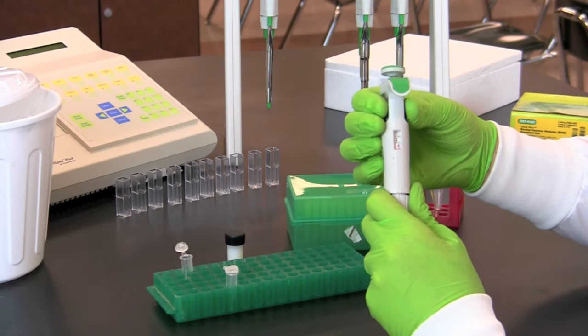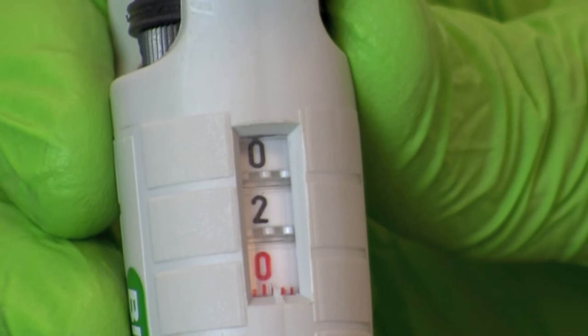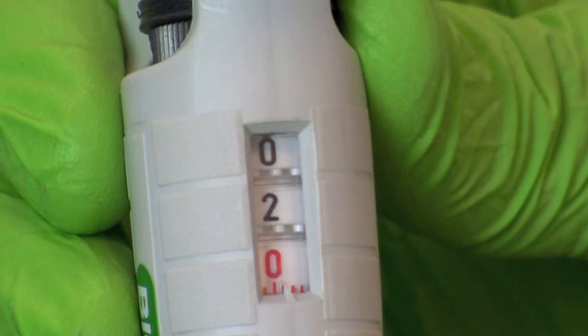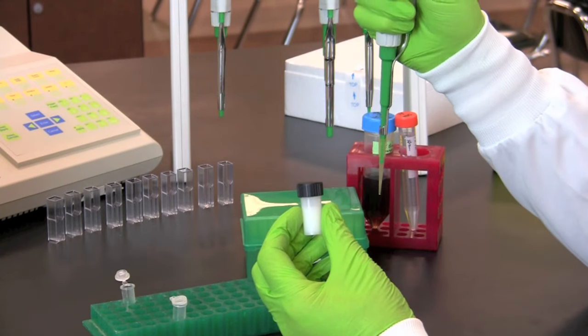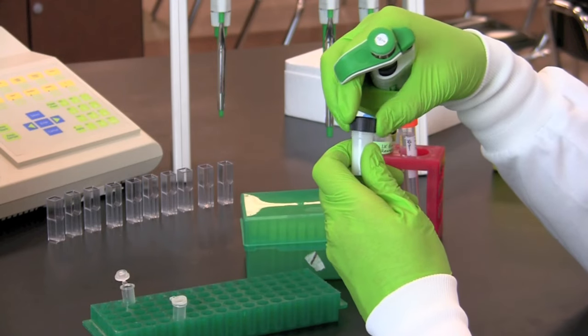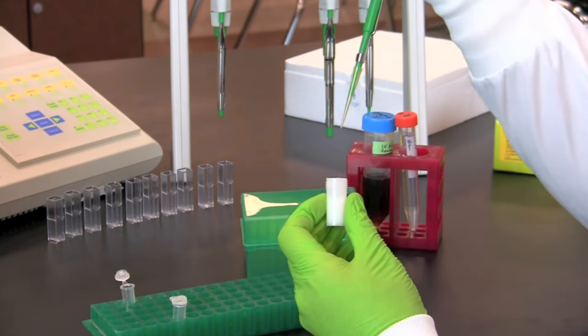Switch to a 2 to 20 microliter micropipet and set the pipet to 2 microliters. Pipet 2 microliters of milk sample into the microtube labeled sample A.